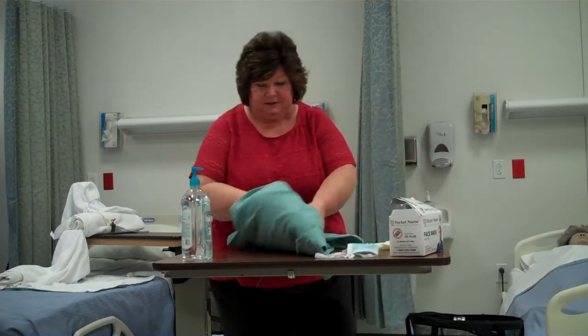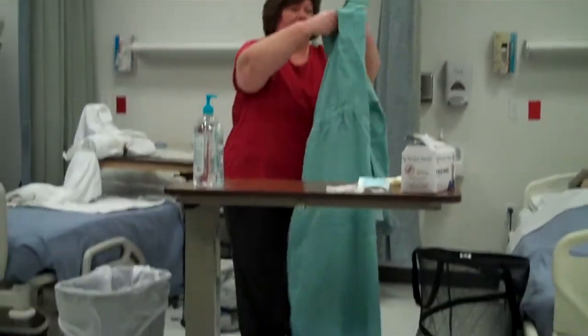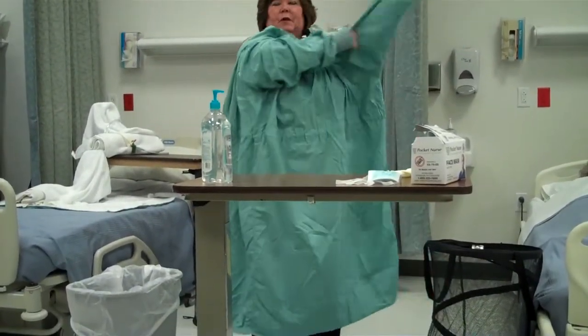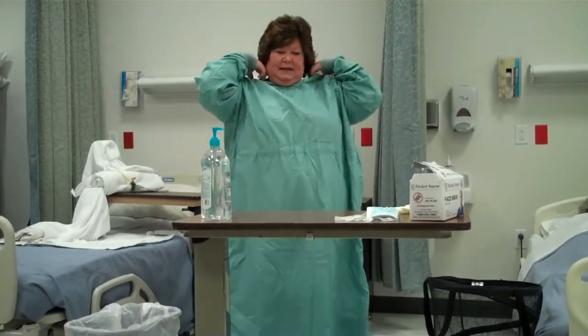So my hands are washed. First thing I'm going to do is put on my gown. I'm going to carefully unfold it. The gowns that you'll be using, most of them today are disposable. This happens to be a cloth gown, like you would see more commonly in surgery.